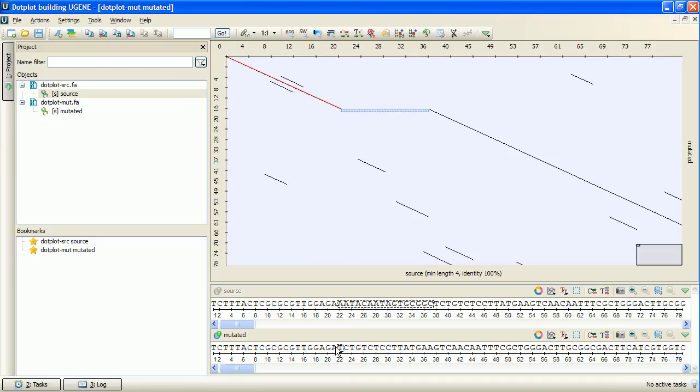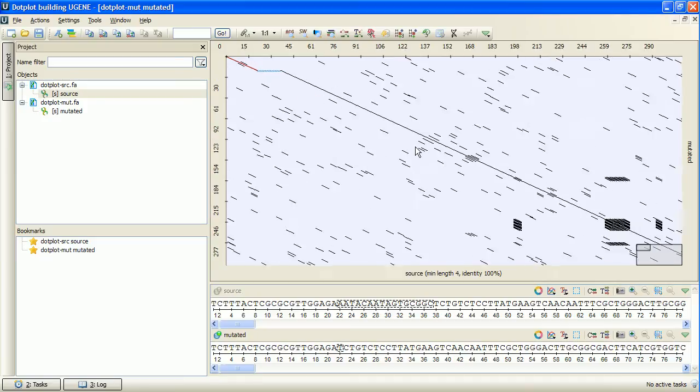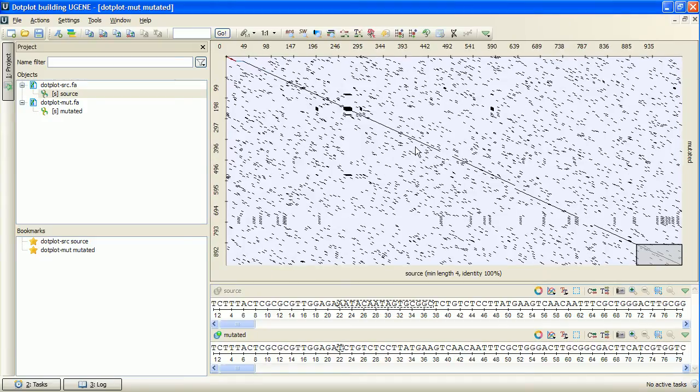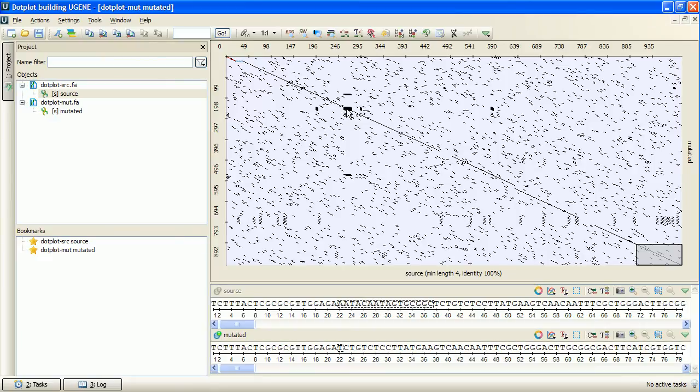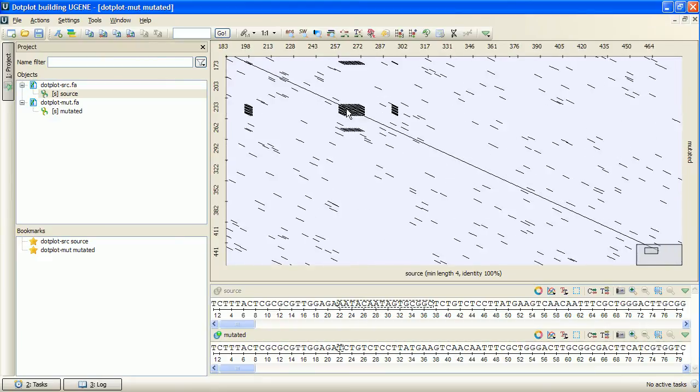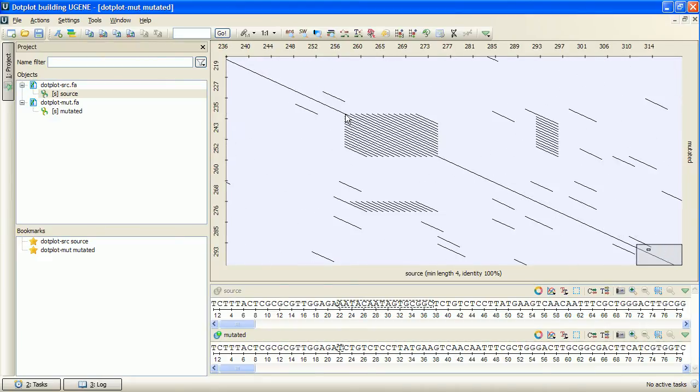I will zoom out the plot. The next noticeable plot feature is this rectangular area filled with matches. This is most likely a low-complexity region. It is a region produced by redundancy in a particular part of the sequence.